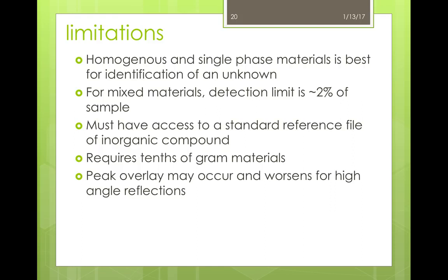Other limitations of this process are that a sizable amount of the material is needed in order to run the test. So if you don't have very much of your sample, it will be a challenge or impossible to run XRD. Lastly, if the sample is being run at high angles, there may be peak overlap, which causes inaccurate peak profiles.